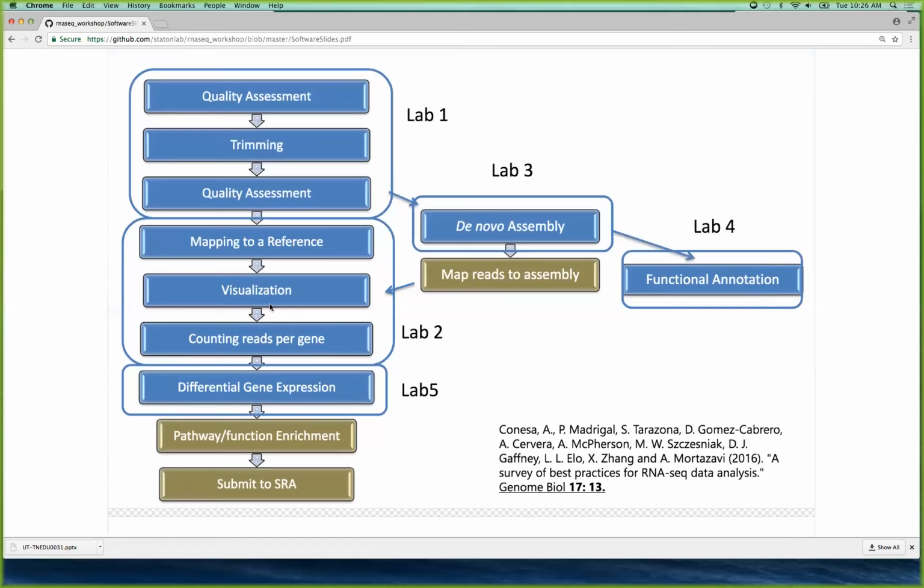There are many things that you can control at every step. This is also only a small review of what an RNA-seq pipeline looks like. But if you want to see best practices in RNA-seq, and also how large it is and how many steps you will need to make decisions at, here you have also a nice paper.